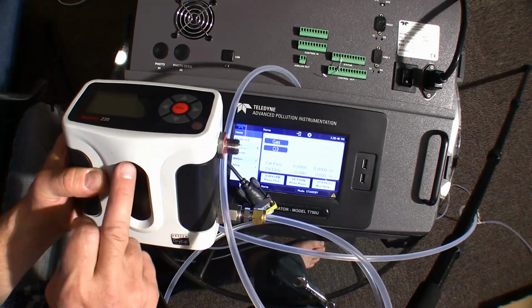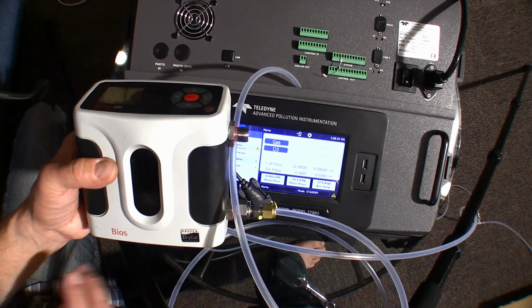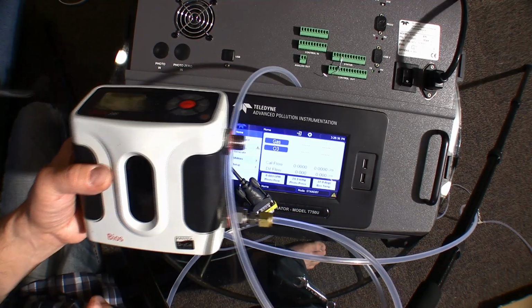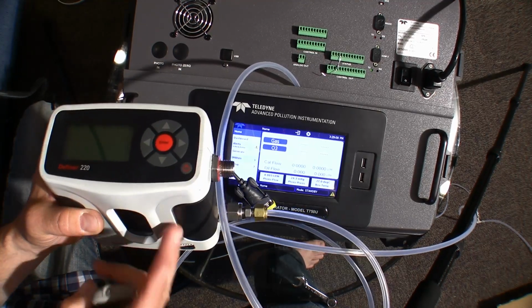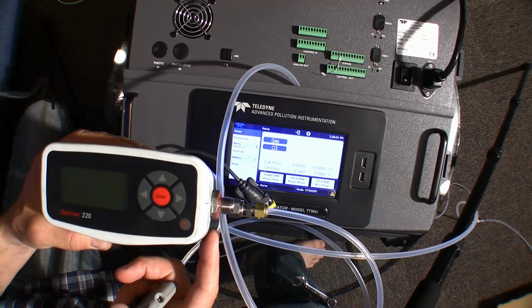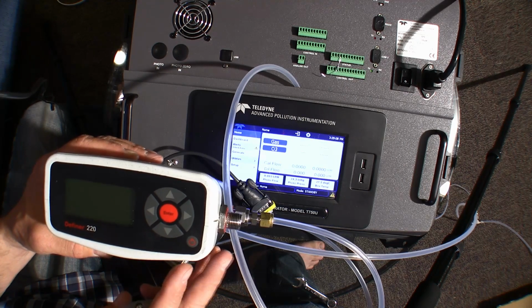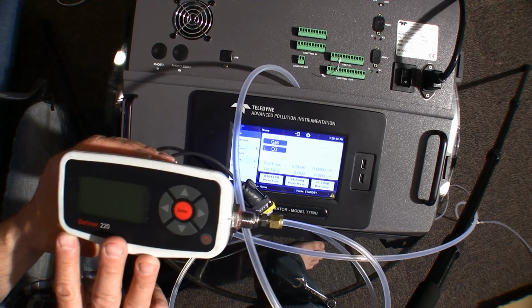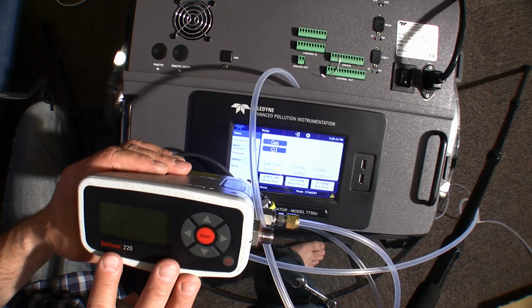This is a graphite piston that moves up and down in a glass cylinder here, and based off the time of flight of that piston, this calculates flow. Now that's a volumetric flow. The device has a temperature and pressure sensor in it, so we can get standard flow or volumetric flow out of this device. In the case of the Teledyne, we want to be calibrating in standard flow mode.